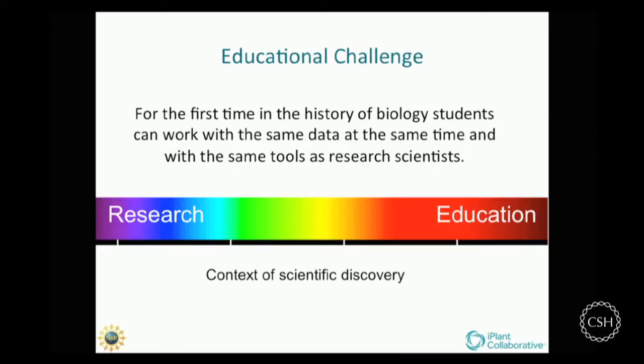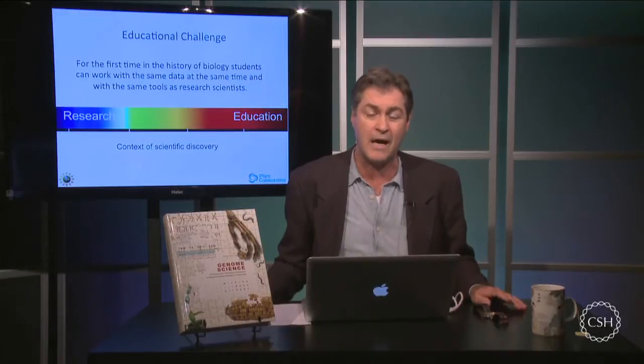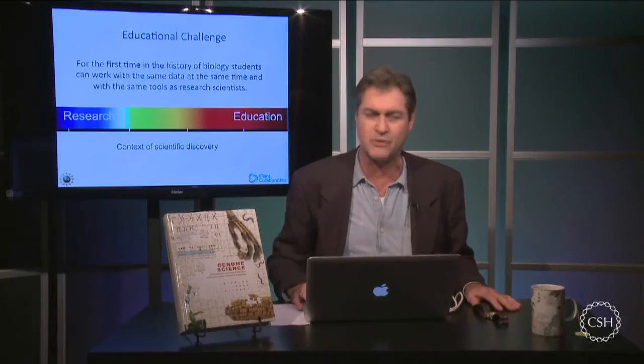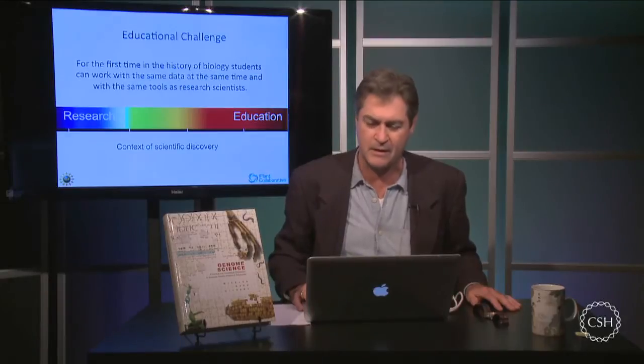And to my mind, it creates the first time in the history of biology or any science where students and teachers can work together with high-level scientists using the same data at the same time and the same tools. And today we're going to see a demonstration of that, especially using online tools for DNA sequence analysis.